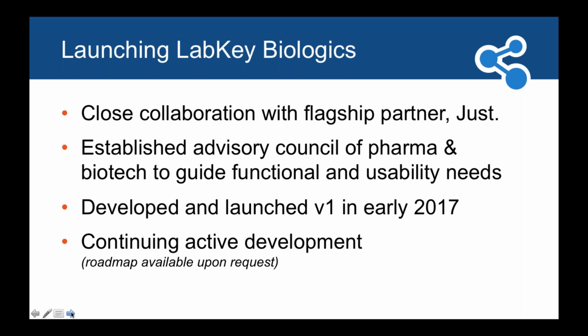One of the more valuable things that can be provided to us is actually sample data to make sure it fits into the system. And a number of those early participants in the Product Advisory Council are now customers of LabKey Biologics. We launched version 1 at the beginning of 2017, but we are continuing active development, and the specifics of that roadmap are very much available upon request if folks are interested.